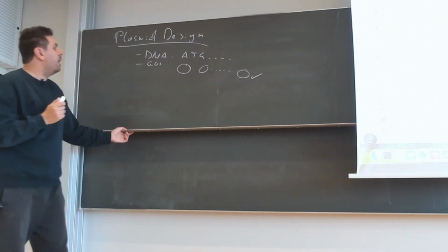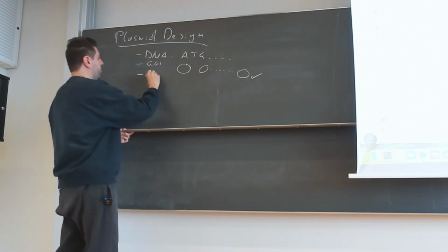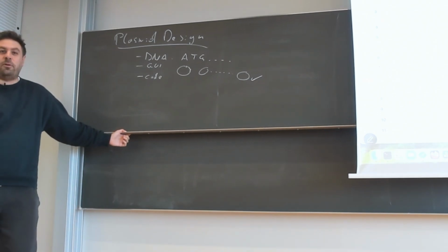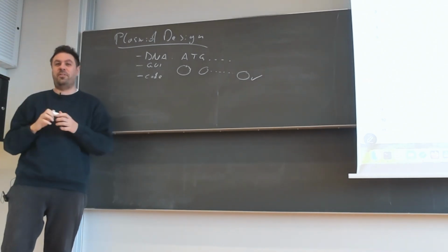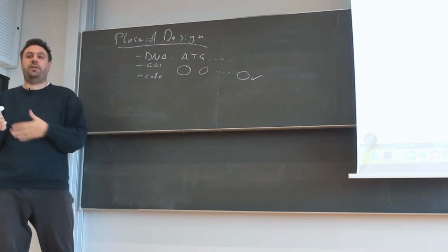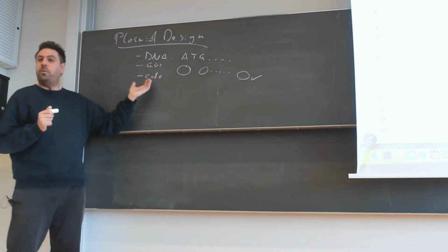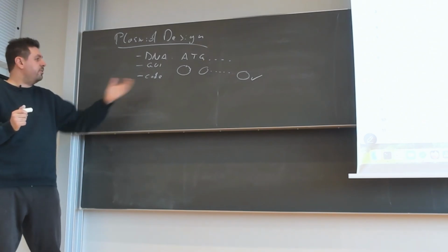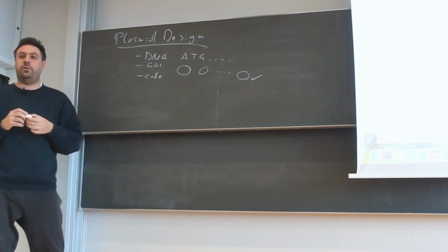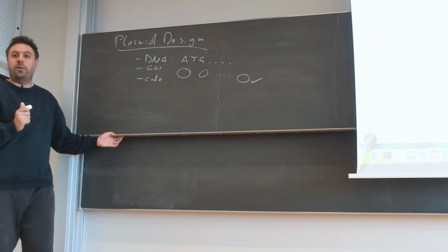We are also not going to use that here, though it's perhaps the most common way to do it. We are actually advocating something different in this lecture, and this is code. So we will use code to create code. This is a very old concept in computer science. People are normally not writing in machine code or assembler code. You write compilers, and we are perhaps not doing a fully fledged compiler here, as it is out of scope for this lecture. But we are still generating the DNA code with Python code. This is the concept here.